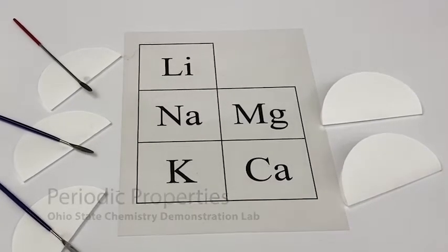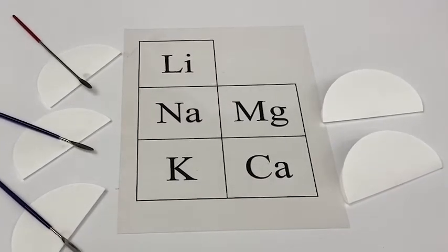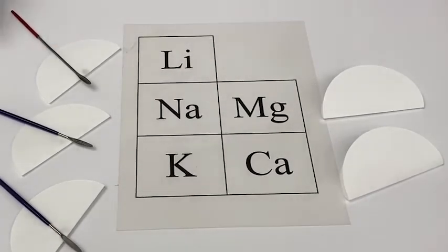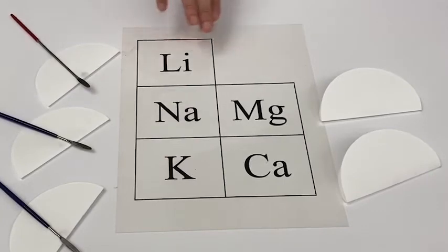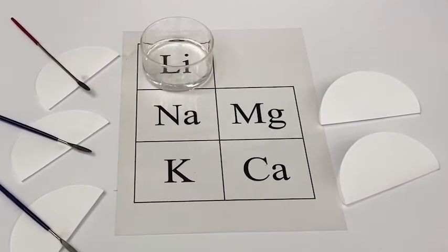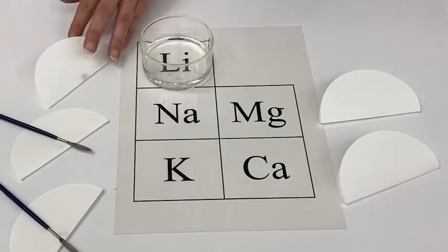This is one of my favorite demonstrations. We're going to look at the differences in reactivity down a family and across a row. You can see we have a selection of alkali metals and alkaline earth metals. Each of these dishes has phenolphthalein to indicate if there's a basic reaction.